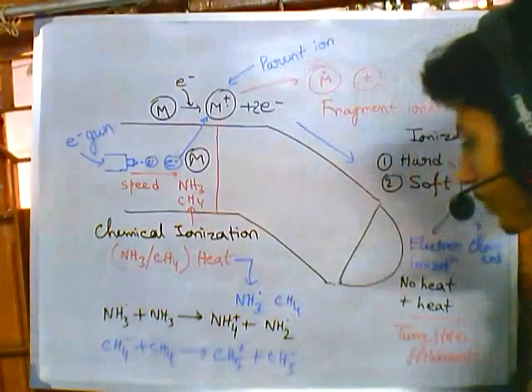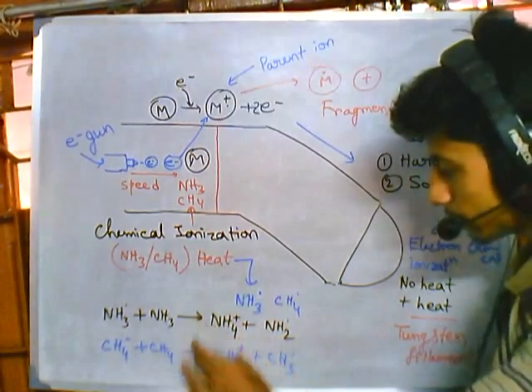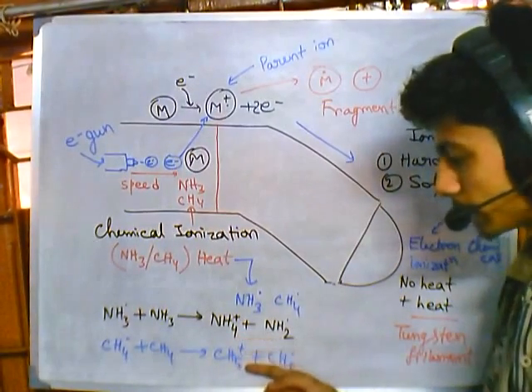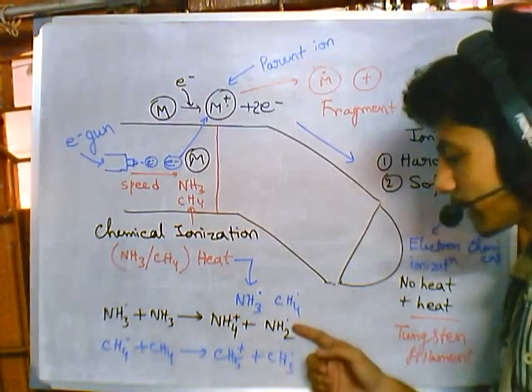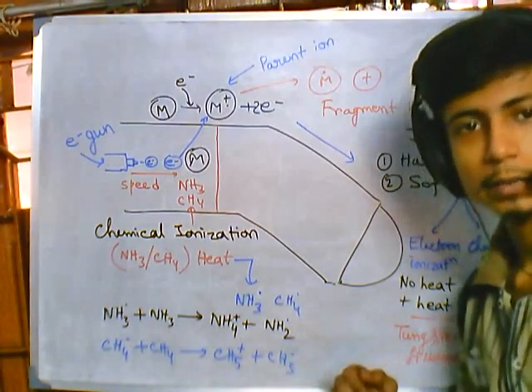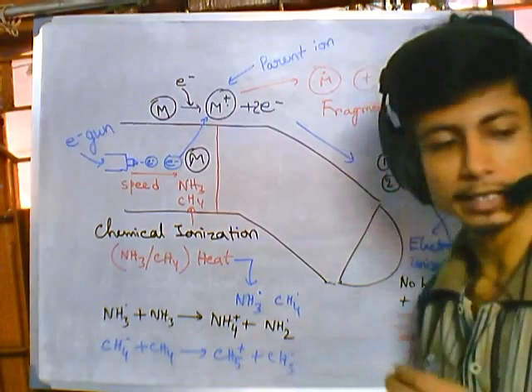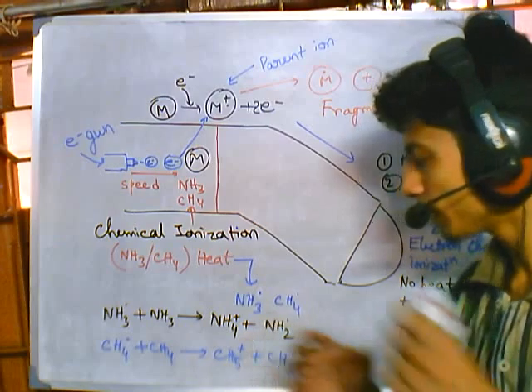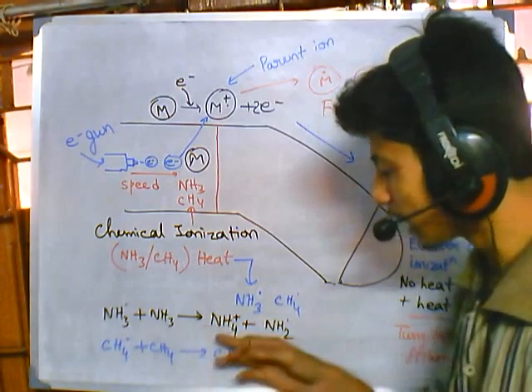Now when they are producing these gaseous cations or chemical cations, and also some reactive ion species of gases, they can go and interact with the chemical sample that we are utilizing. Okay, and they will interact with the sample. So now in this case, NH4+ and CH5+ are the cations.